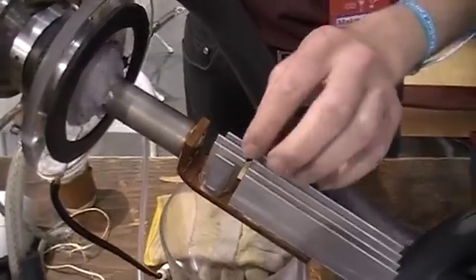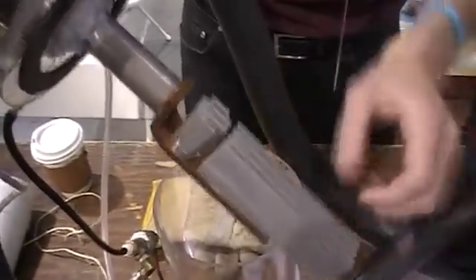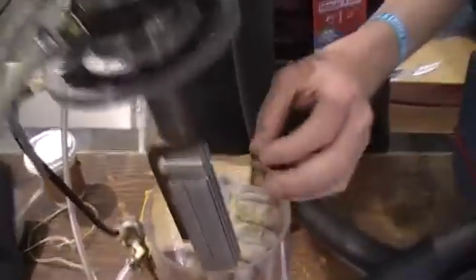The nitrogen condenses and drips off of it. So if the device is set up inside a tank, the nitrogen drips off and collects in the tank.